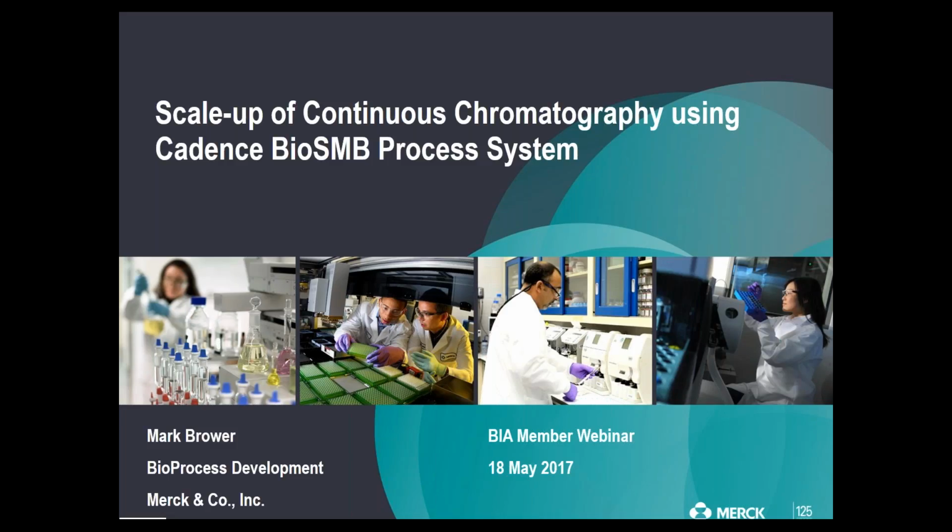And as you can see, the name of my talk is Scale-Up of Continuous Chromatography Using Cadence BioSMB Process System. But really, the talk covers the scale-up aspect of going from PD to process. So I wanted to start off the talk today by not taking for granted that everybody in the audience knows about continuous chromatography systems and how they work.